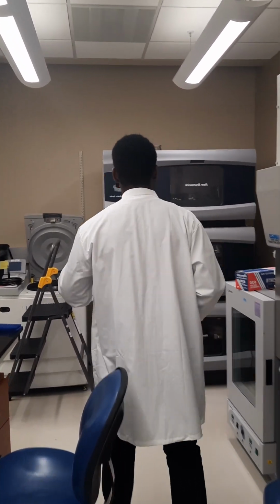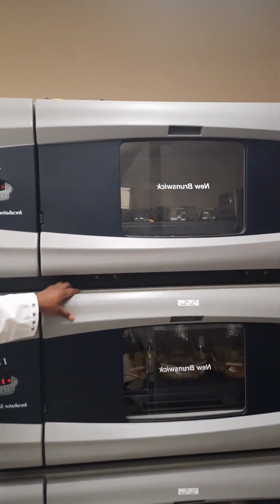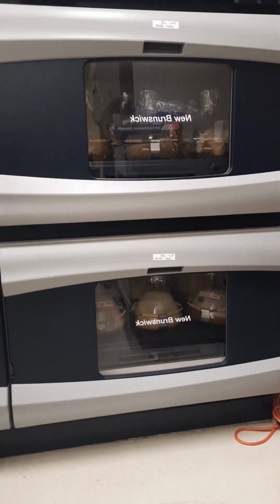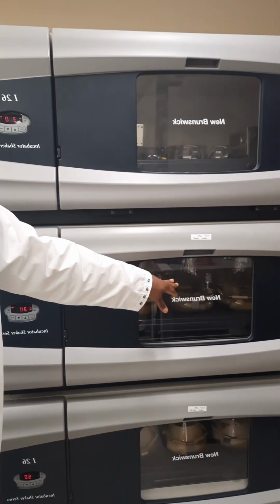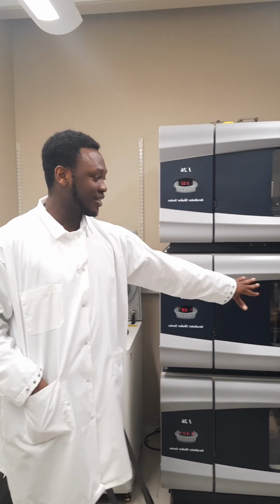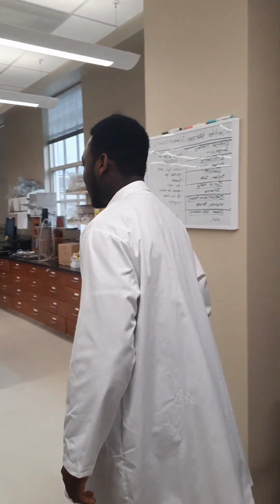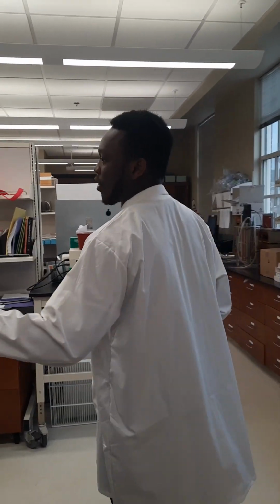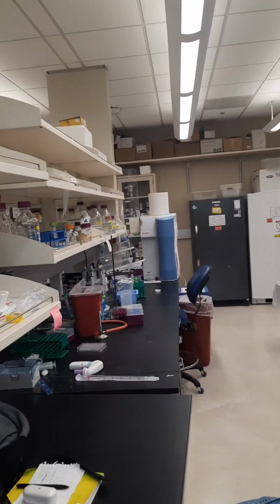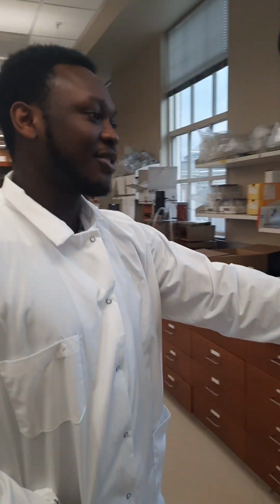This is what we call the incubator. As you can see, presently I'm overexpressing a particular protein. So our protein is basically going to be released into the cell, into the media, and then we carry out further processes. So this is a protein production in progress. This is my workbench where I carry out a lot of my biochemical reactions to understand the biosynthetic pathways of our enzyme. And this is a centrifuge.